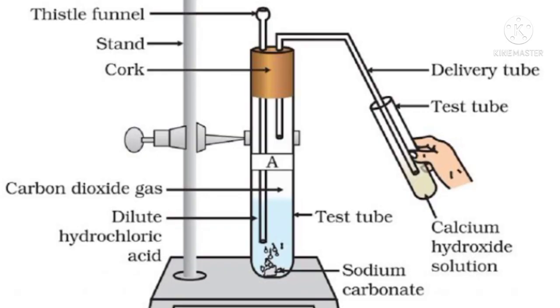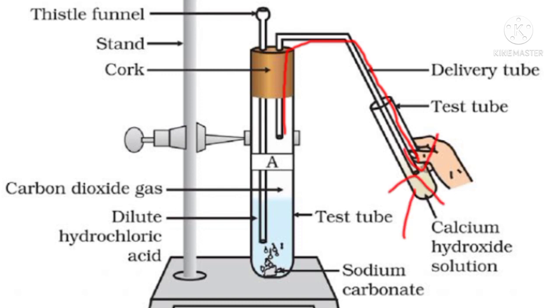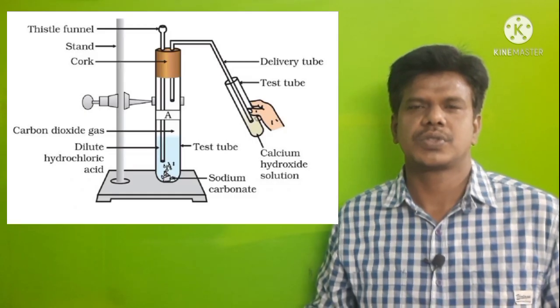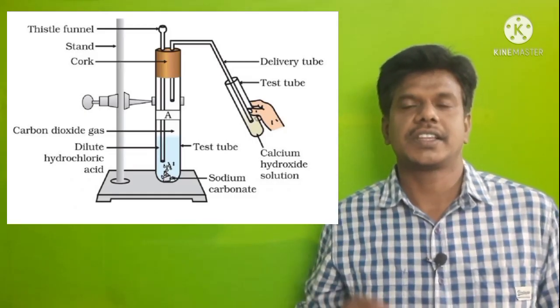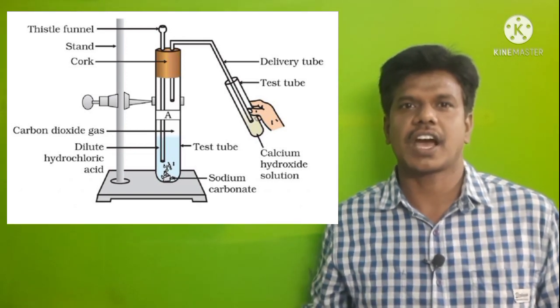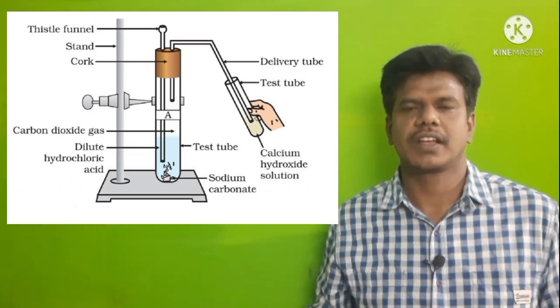Add 2 ml of dilute HCl to that test tube. A few bubbles come out. Allow the gas to pass through the calcium hydroxide solution in the other test tube. The calcium hydroxide turns milky white, indicating that the gas produced is carbon dioxide.